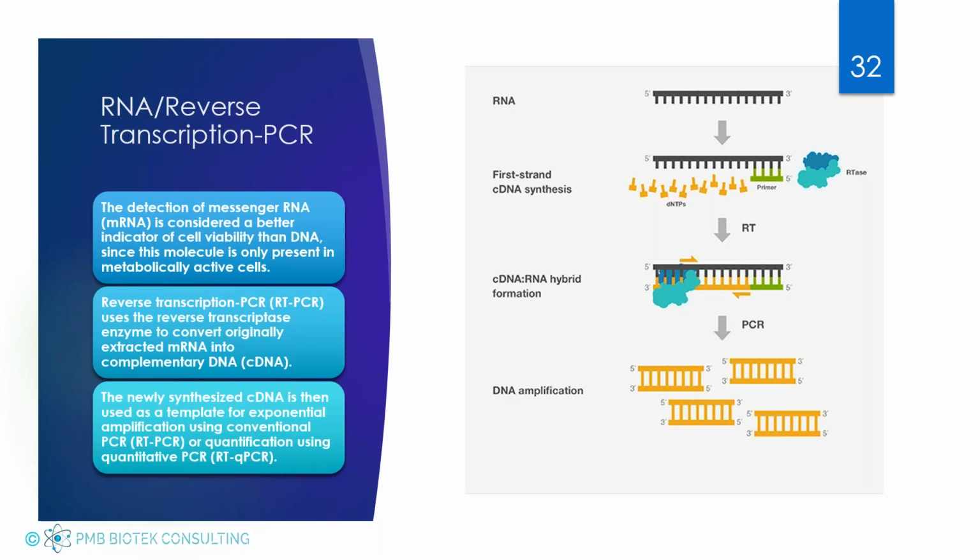So we're taking that RNA, we're building off of it, and then we're reversing it to DNA. So it adds a little bit more steps to the process than traditional PCR, but it does ensure that you're getting viable organisms tested or present. So if you're worrying about false positive reactions more so than invalid reactions, then RT-PCR could be a solution.